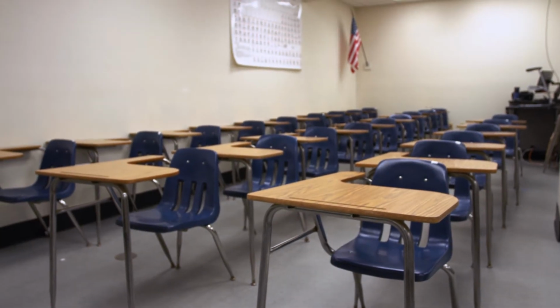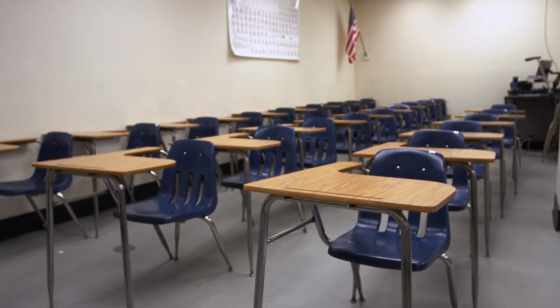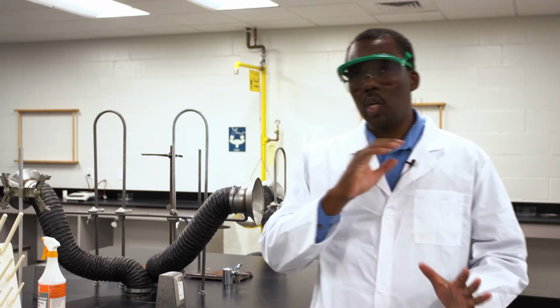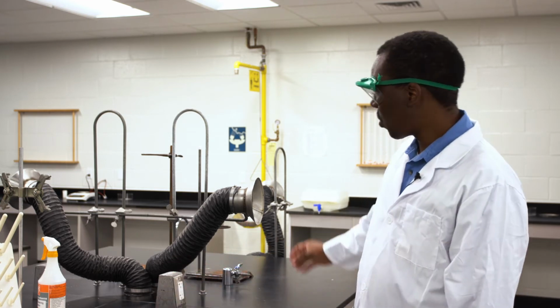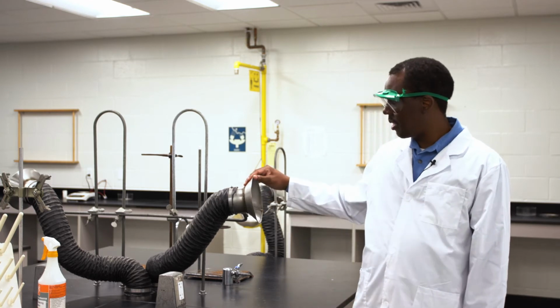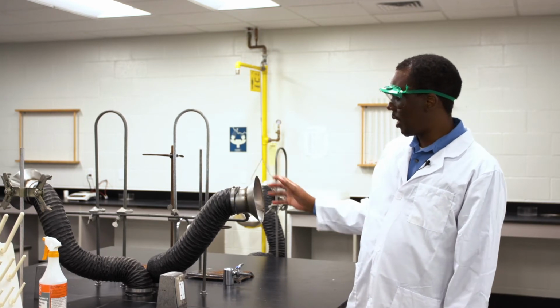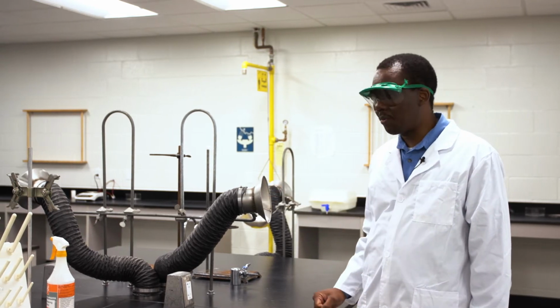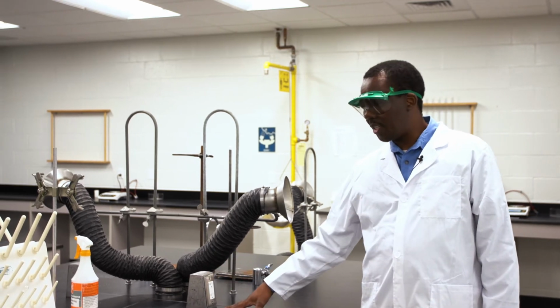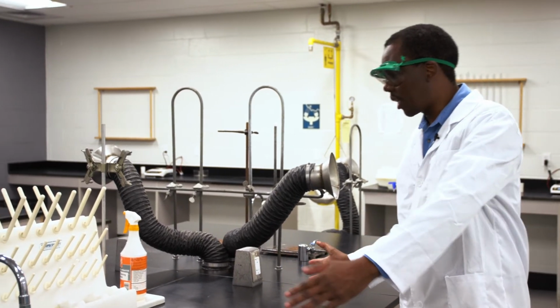Now in the lab, we have the classroom meeting area. You always sit there and wait for the instructions about your lab from your instructor. And the lab working area, you will be assigned an area, looks like where I'm standing right now with the fume extraction vent. This here has a suction to suck away any fumes that may come from your experiment. Try to set them up next to this fume vent so they can be drawn away. And you have your mains to plug in your electrical equipment if you're using equipment that uses power. And this here is your work area.